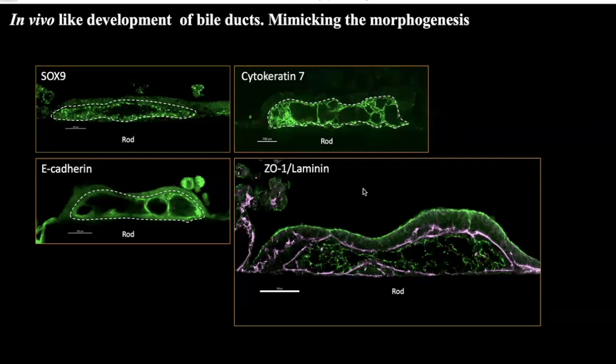Just to put this in perspective, there is no extracellular matrix added to the cell culture. There is no Matrigel. The cells are only feeling the extracellular matrix that they secrete themselves, or the gelatin that is on the rod. We do not embed the entire system into any extracellular matrix. So you get this lumen and multi-layer structure here, which is well polarized at the very top.